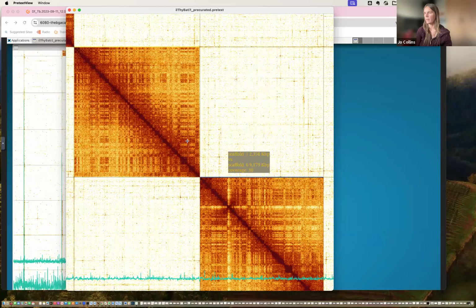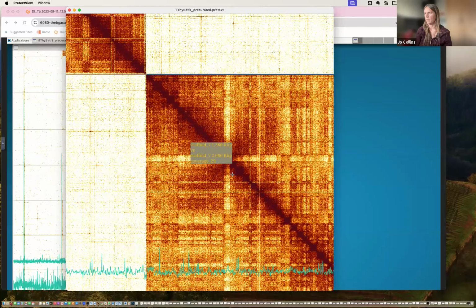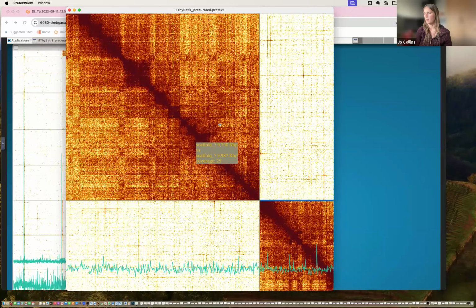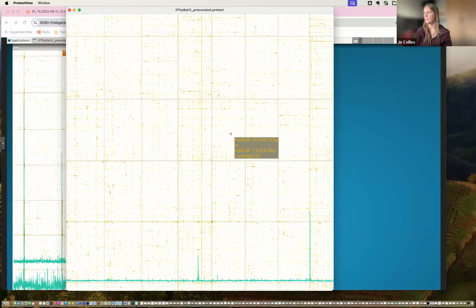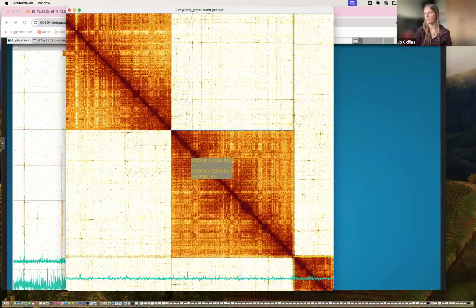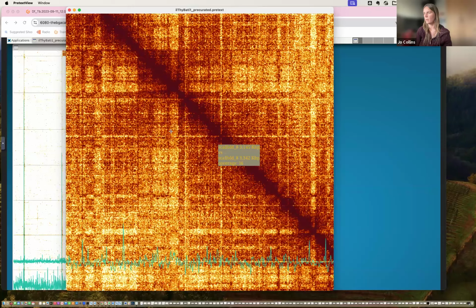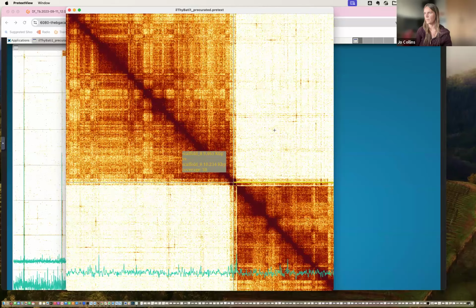Okay, come back. And then we will go through this scaffold. Same thing again: scaffold fidelity looks good. Nothing in the shrapnel to go in. So this is quite a quick curation so far. Again, we're looking through, looking to see that contact. All looks good.